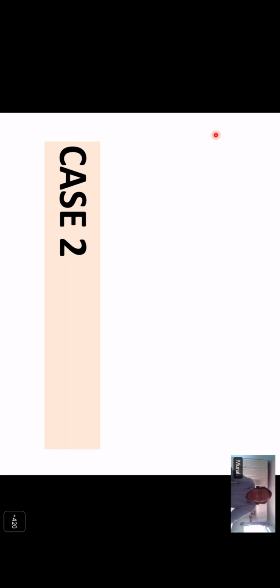Thank you, sir. Thank you. Sir, one last question just to pop up in here. How will you distinguish a signet cell that looks malignant from a real signet cell of a rectal carcinoma?